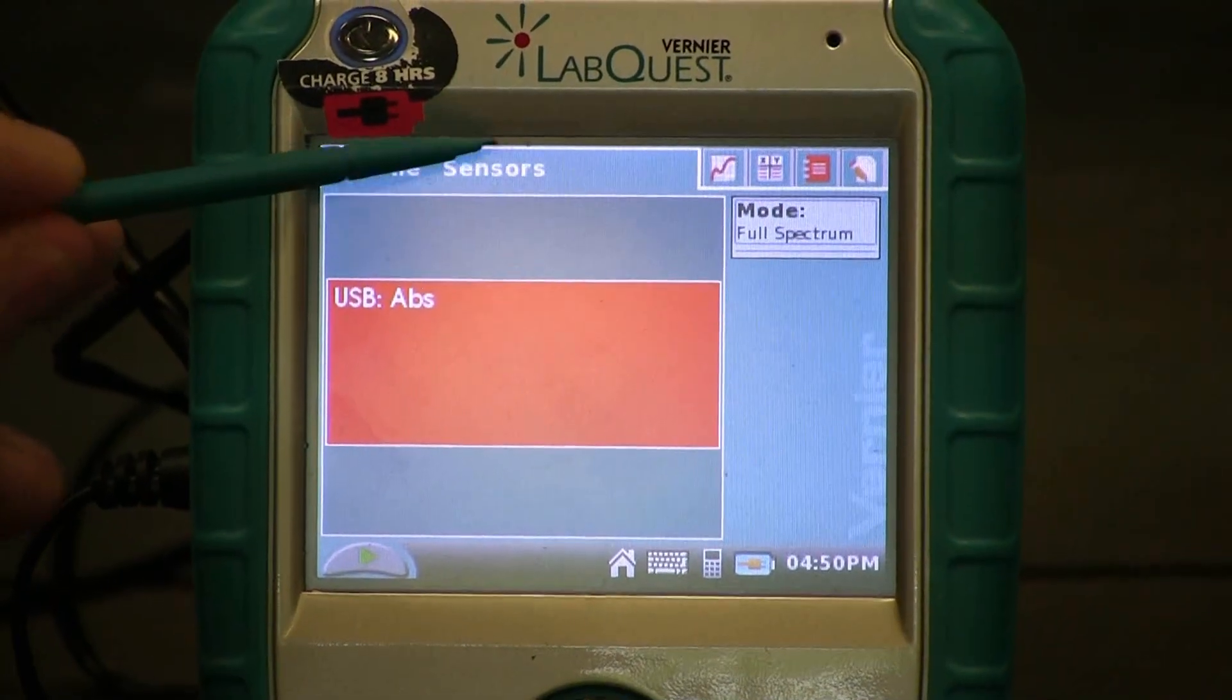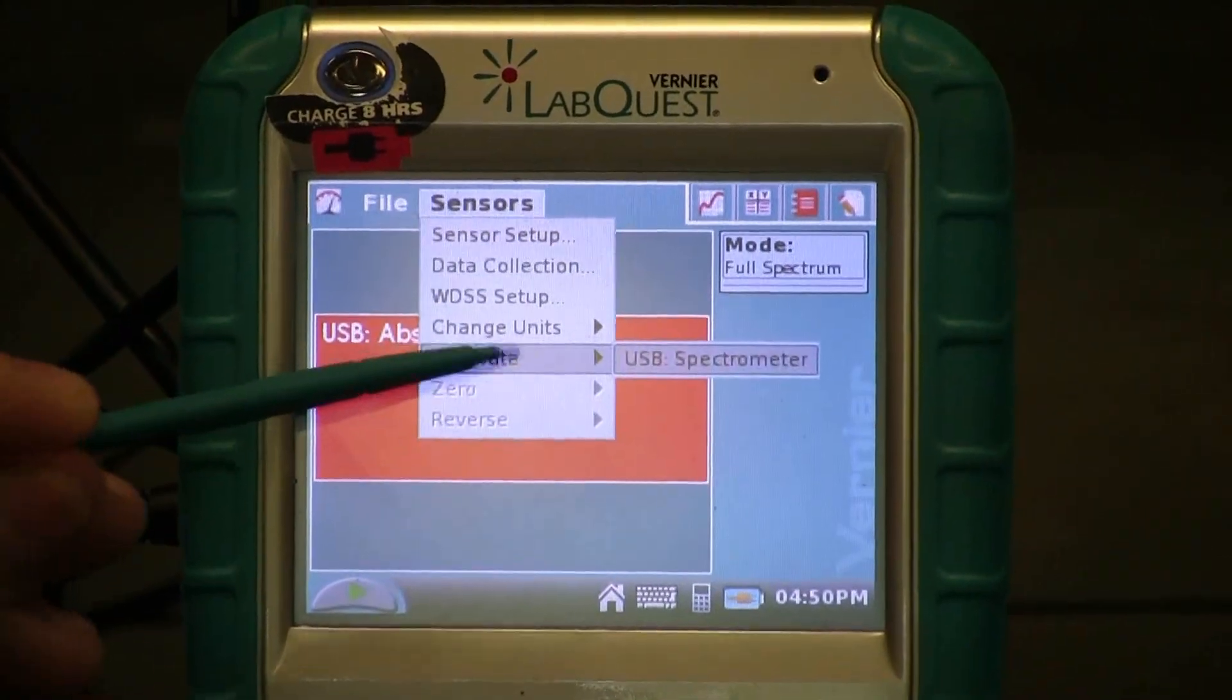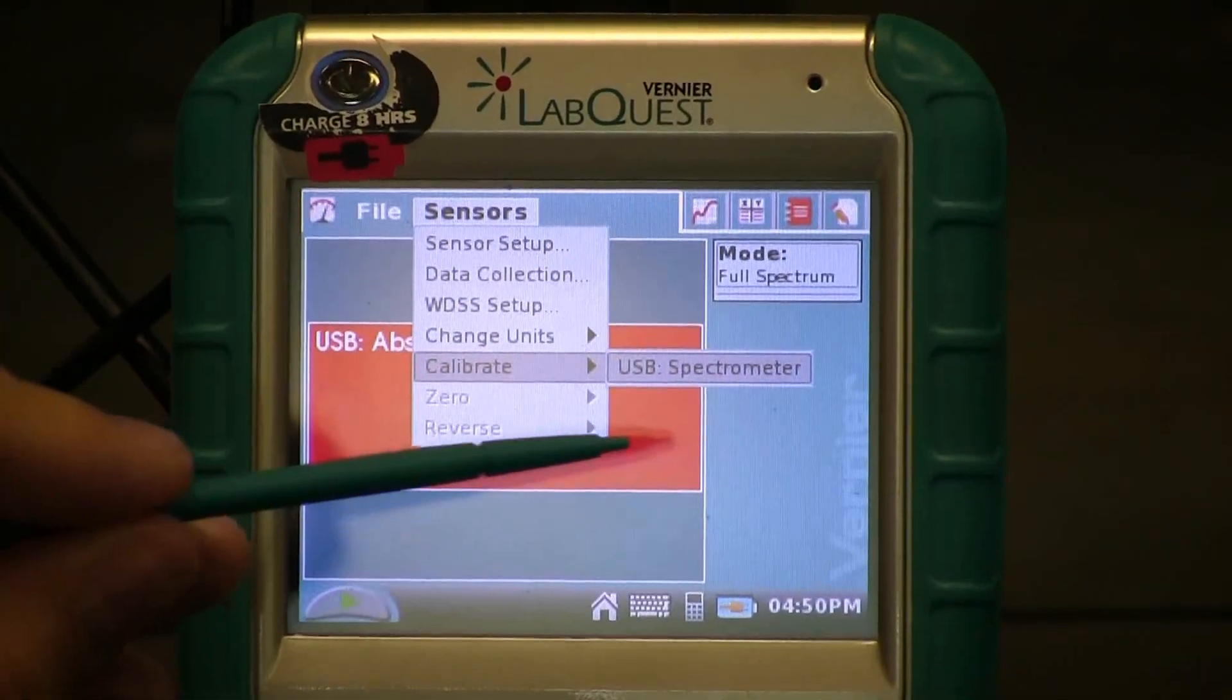You are now ready to calibrate. Start by clicking on Sensors, Calibrate, USB spectrophotometer.